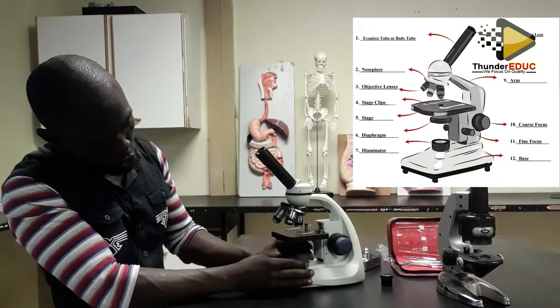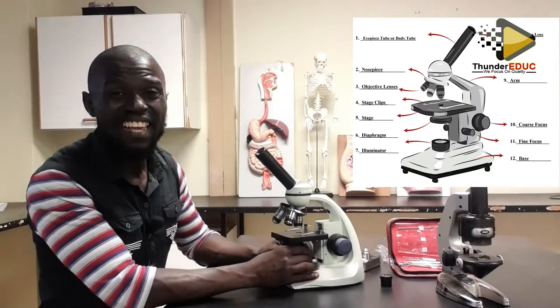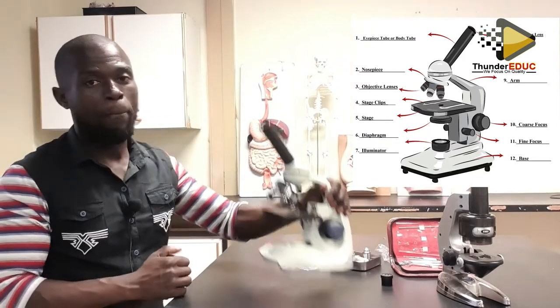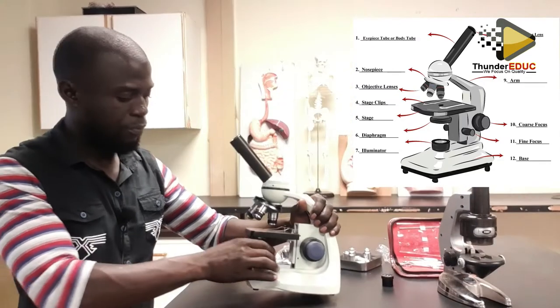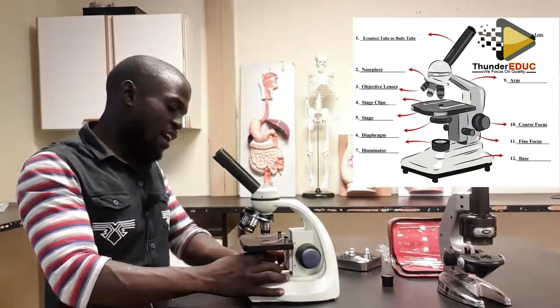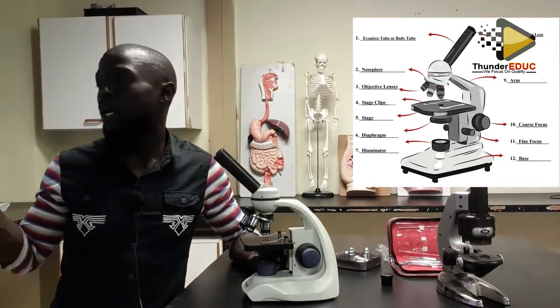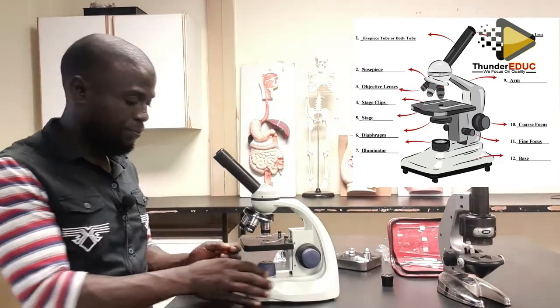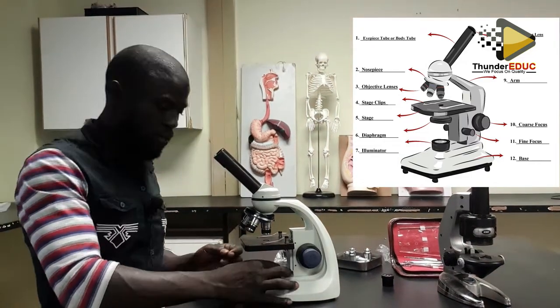Now it has what you call the light source. You can move it. It has a bulb inside. However, some don't have bulbs. They have just a mirror, and you have to be next to the source of light. When you turn it, it can bring about the focus. It also has what is called the diaphragm and what is called a condenser.